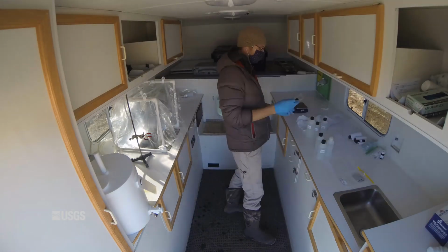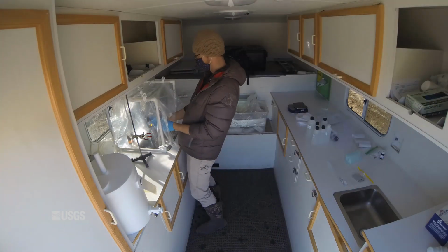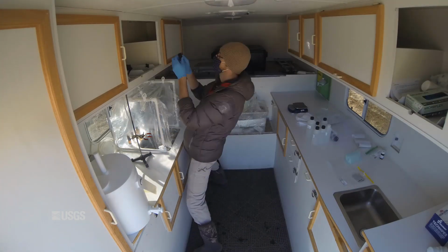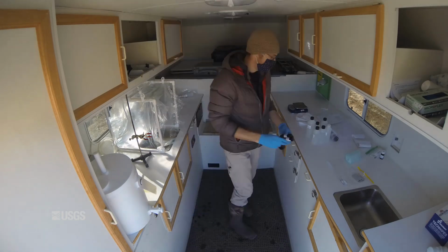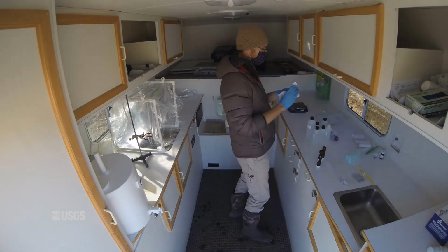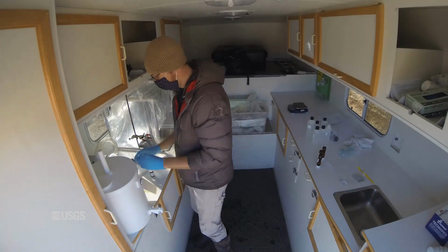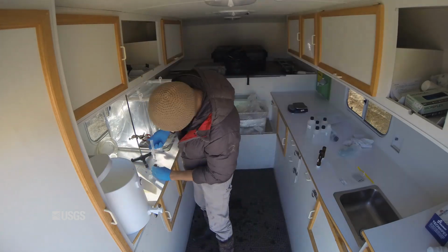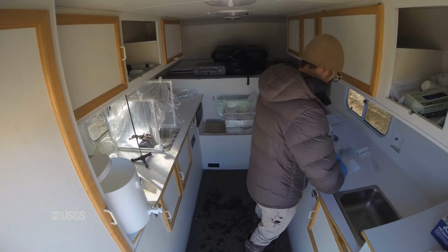Wipe them down, keep them nice and clean. Doing these glass bottles. These are just a different type of sample. No air bubbles can be in these. Nice and clean. There we go. I'm doing a pesticide sample now. Wipe everything down. Clean everything up. Put it in a bag.